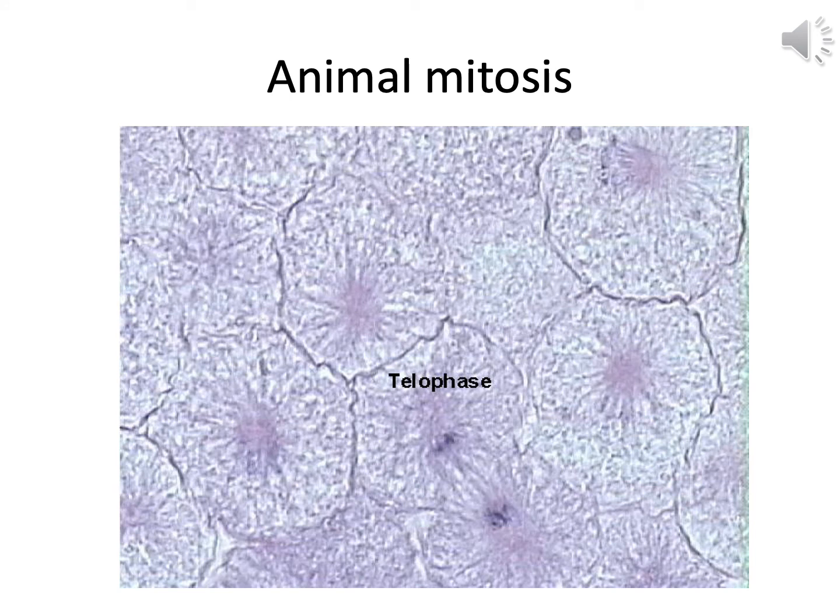Here's a, well, not so great telophase. The cells are moving apart from, I don't know, about 11 o'clock to 5 o'clock. The chromosomes aren't lining up real well so that you can see them, but there's some pinching inward in the kind of axis on the, I don't know, 2 p.m. to 7 p.m. line. You do get some pinching inward, and you can actually see a pretty good cleavage furrow on these two cells. Well, one cell that's fixing to become two cells. We're pulling really far apart and just about to be two cells.